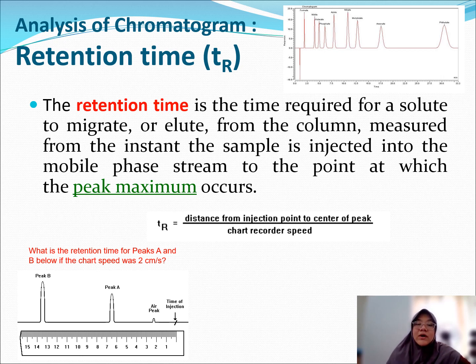However, for the chromatogram that comes out as a graph after using the machine, you can automatically get these results. And the variable usually measured is the retention time of the compound that elutes, the retention time of the product of the compound being eluted.